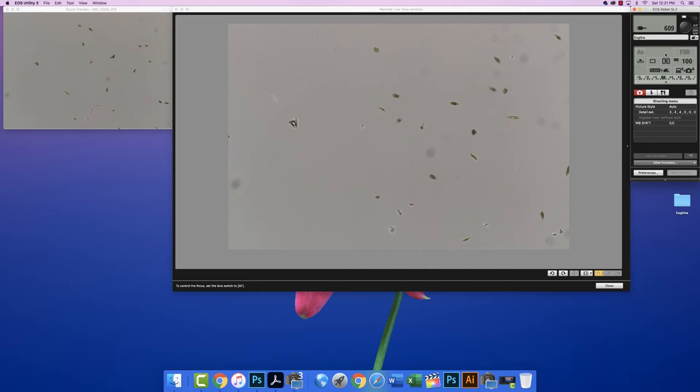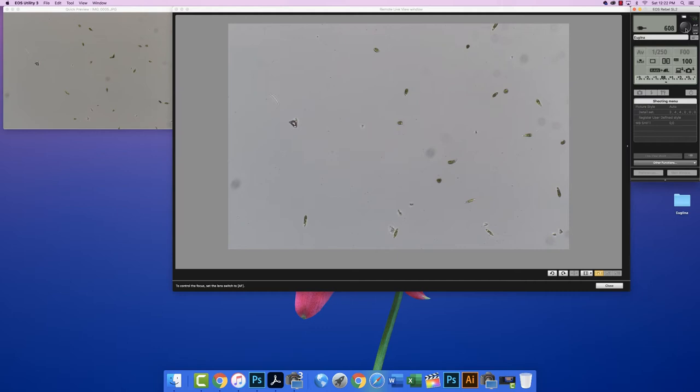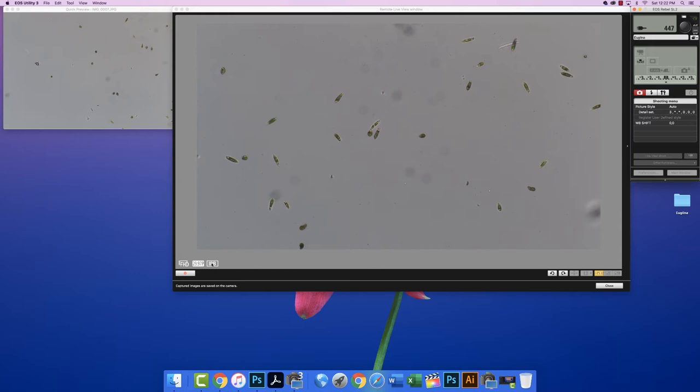So I'm going to increase the amount of light, and let's go up to a higher shutter, 1/250, and recalibrate our white balance. Okay, it looks good. And take a photo. Take another one. All right, we can take a little movie, so I'll switch the camera to the movie mode. Here's movie, and I'll start the movie, which is now saving to the card on the camera.